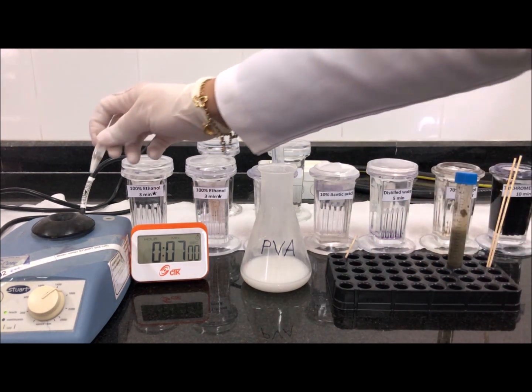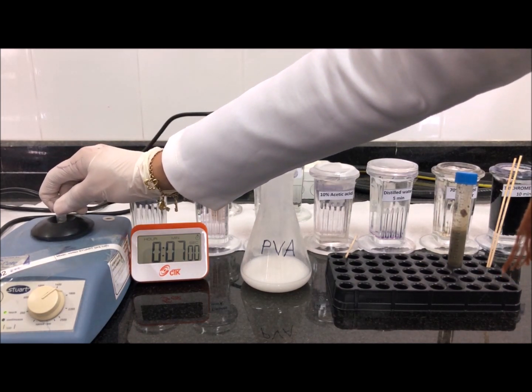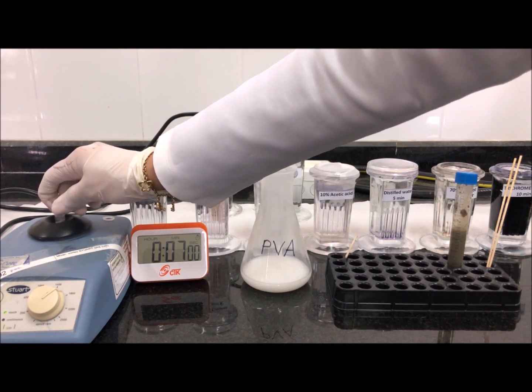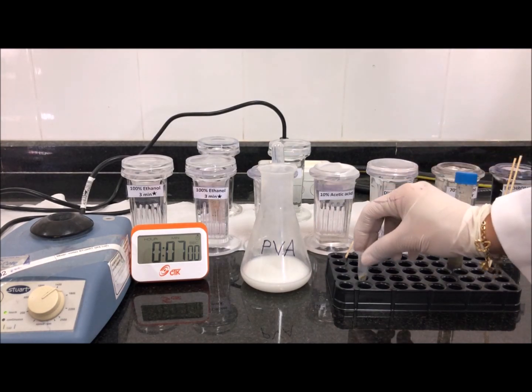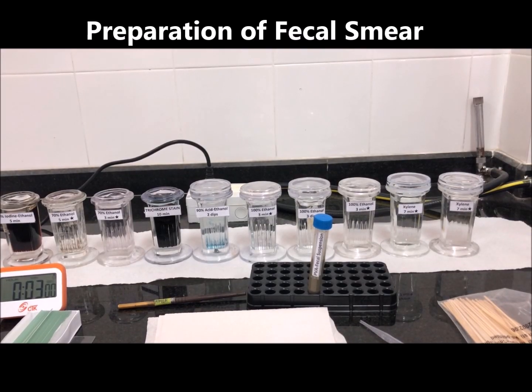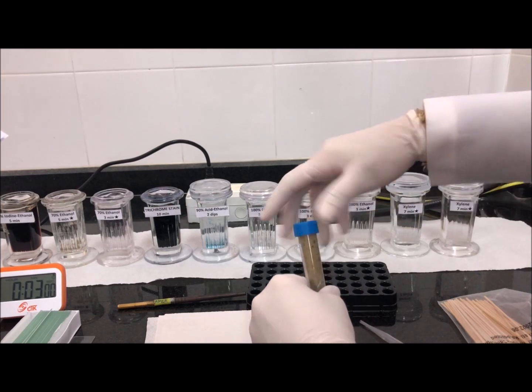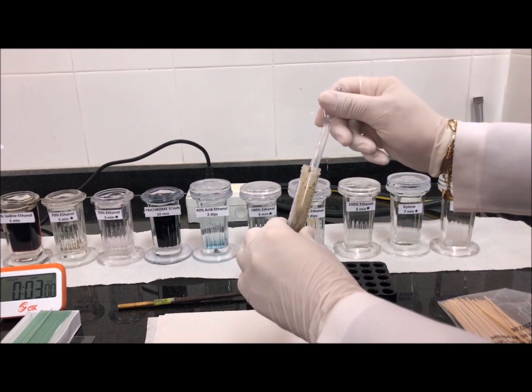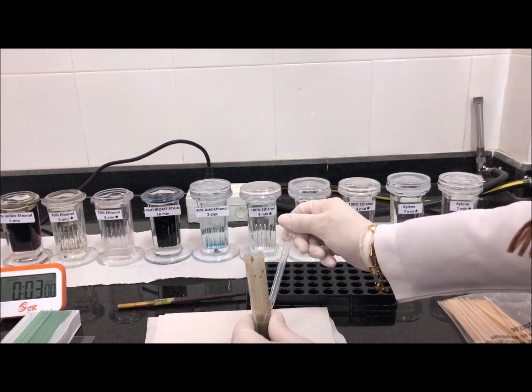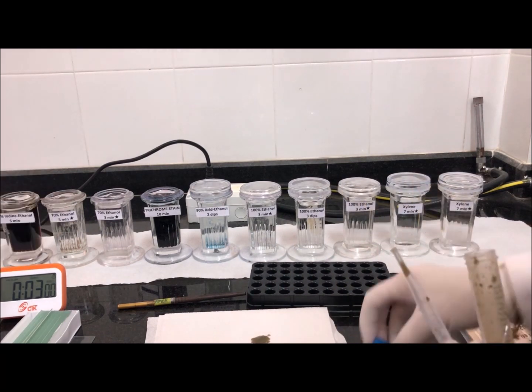Vortex for a few seconds, then allow to stand for 30 minutes. The next step is to prepare the fecal smear: pour the mixture onto a paper towel and allow to stand for three minutes to absorb the PVA. Add more material using wooden applicators as needed.